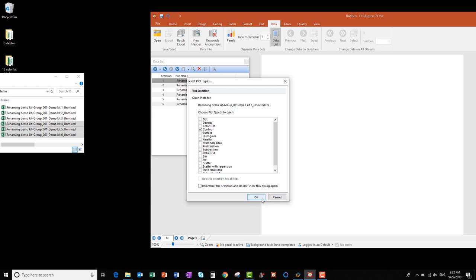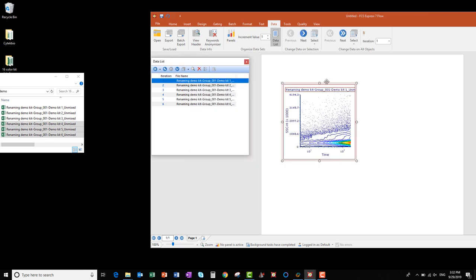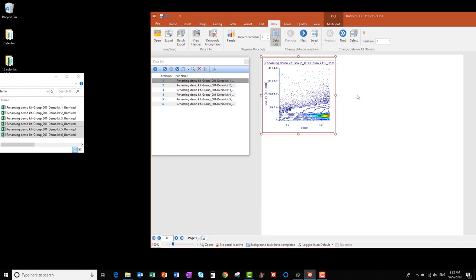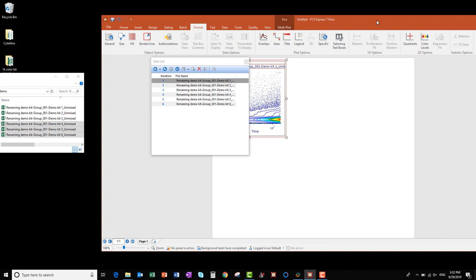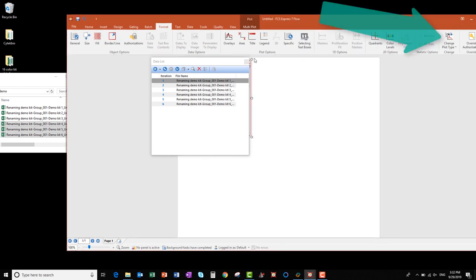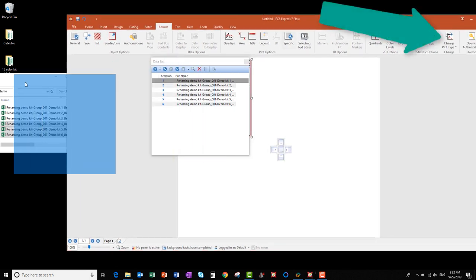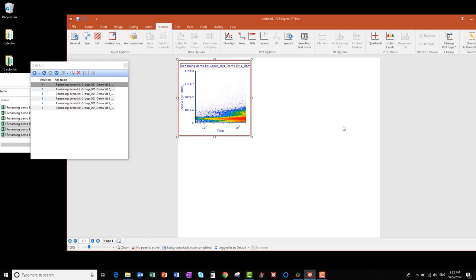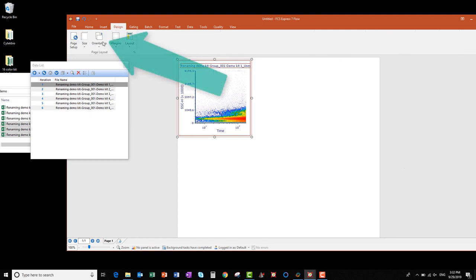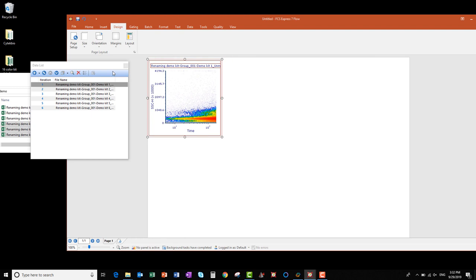Click OK to create a plot in the layout. If you want to change the plot type, make sure the plot is selected, then go to the Format tab and click the Change Plot Type button. I'm going to change this plot to a Density plot. The layout by default is in Portrait Orientation. If you want to change it, go to the Design tab, click Orientation, and select Landscape.